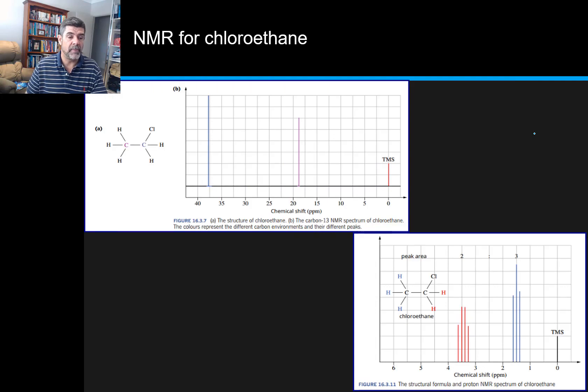So here's another one just for comparative purposes, and you see this time we do have the TMS identified. You can see that there's a peak occurring here around the 17-18 mark and another one occurring up here around the 37-38 mark. So we would need to go and have a look at these in order to try and get an idea of what we're actually looking at. One of these is actually corresponding to a carbon environment which contains carbon-hydrogen bonds, and one of these is telling us that there is actually a bond to a halogen present in the molecule.